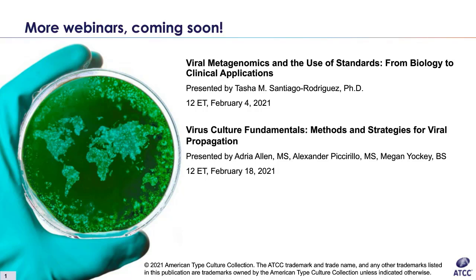I was just going to say, if they're growing continuously in culture, at least every few months, I would say, at least once a year. But if they're growing continuously, you have them just expanding, every few months, I would probably suggest testing for it. And of course, if there's any reason that you suspect you may have had contamination, like Brian said, if things start looking funny or whatever the case may be.